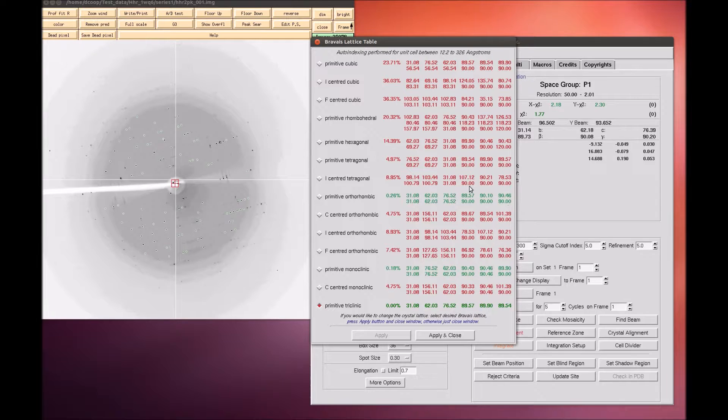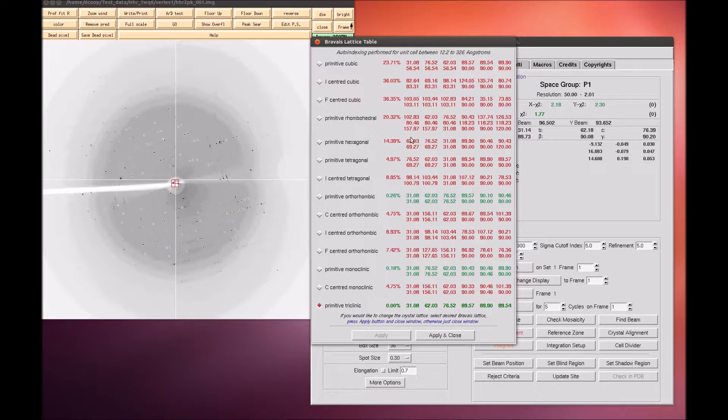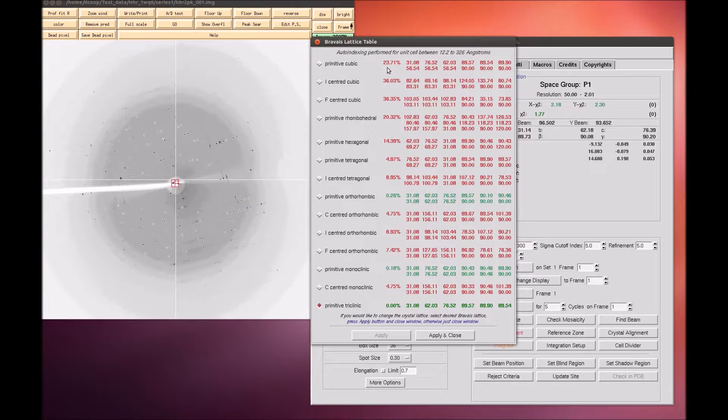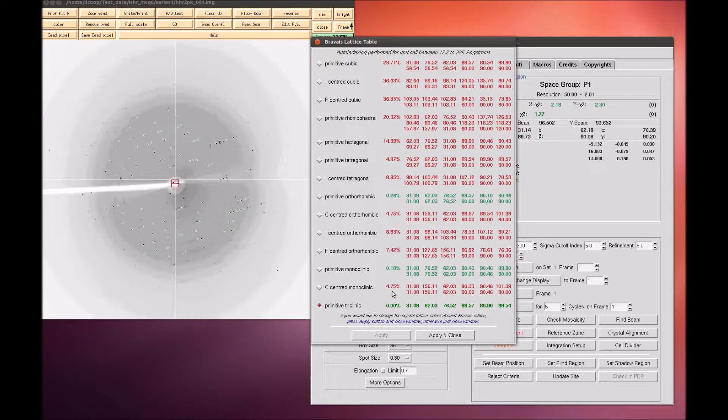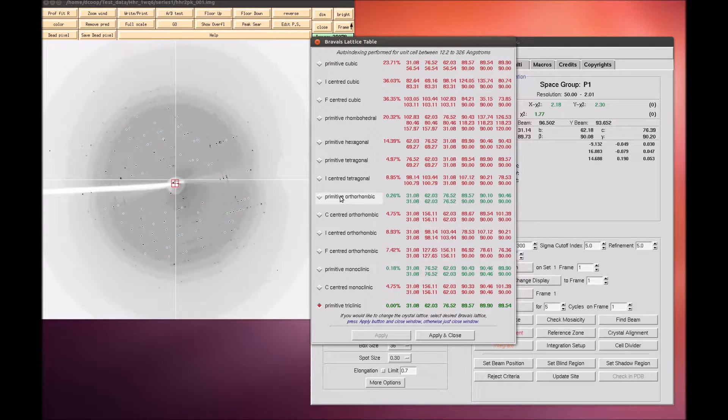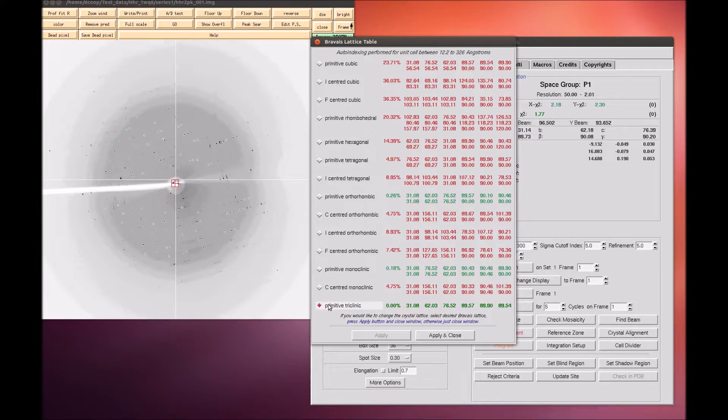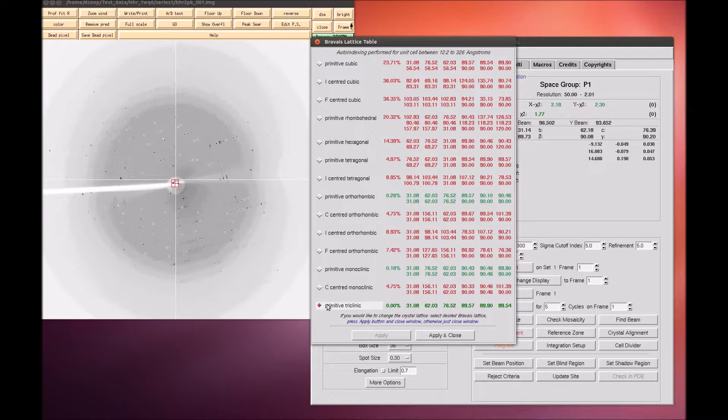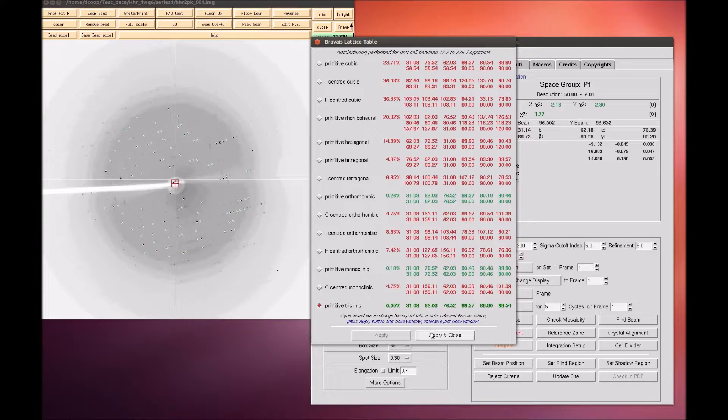For example, primitive tetragonal crystals have A equals to B and angles equal to 90. Each crystal class is presented with a correlation coefficient that represents how well these two unit cells agree. HKL color codes the fit from dark green to red. Often you may select the crystal with the highest symmetry with a good correlation coefficient, but a better practice is to initially select the P1 unit cell and refine the unit cell before selecting the crystal class.